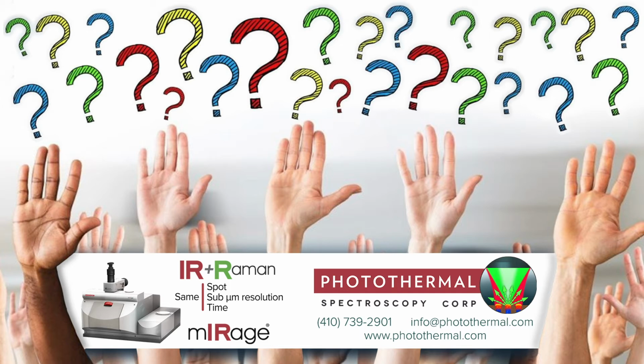So I couldn't say definitively that the cells are not stressed at all, but I don't think we're seeing the same levels of stress as in Lisa's study, where they had successively smaller and smaller gaps, so the cells were being squashed, and they saw some slight changes in the spectra that they attributed to a stress response. Although I still think there might be optical effects going on in there as well.